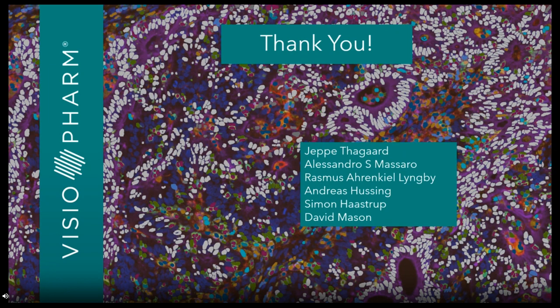Yeah, thanks. So we have tested that, and also in my previous jobs, we have tested the section thickness, and we found that the best consistency was 3 or 4 micron. So that was really the best, where you don't have too many cells that are overlapping or hiding each other or on top of each other. And the more you move to 5 and 6 micron, the more you also have section thickness artifacts, because you can't always guarantee that you cut at the same size due to temperature changes, etc.